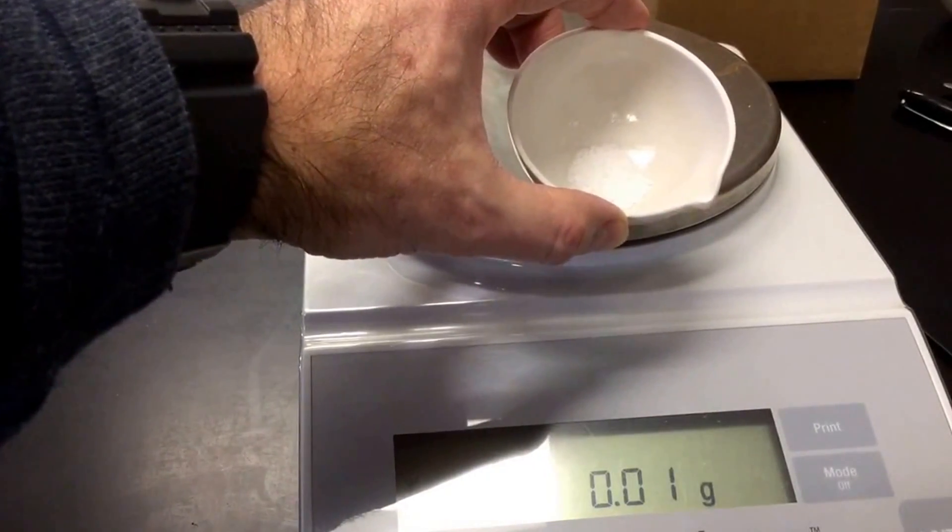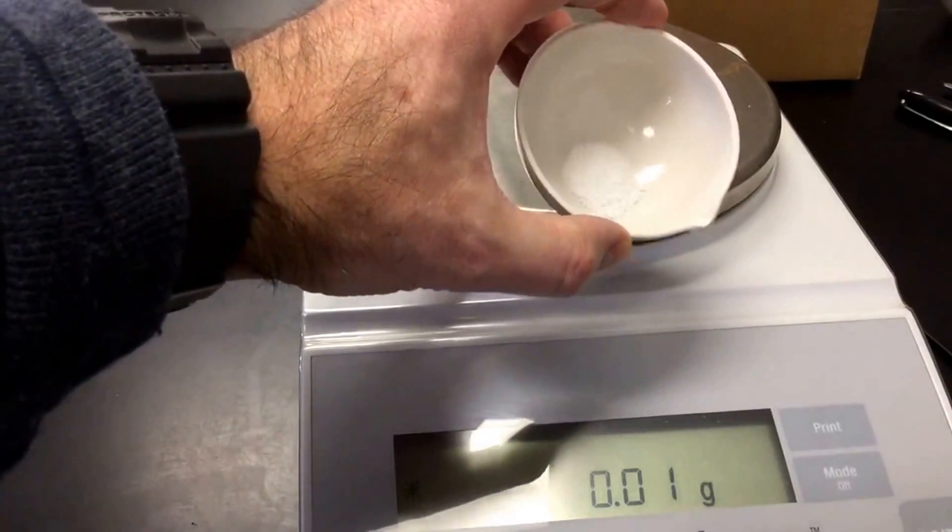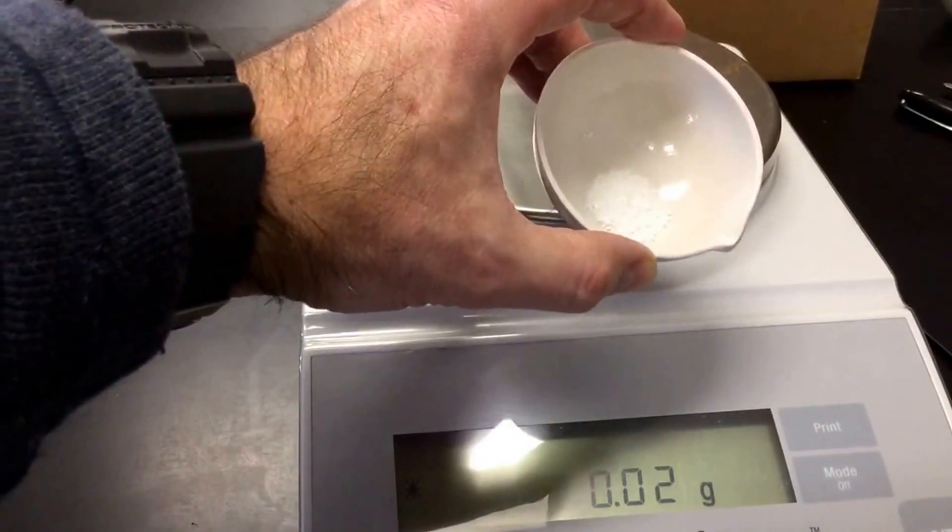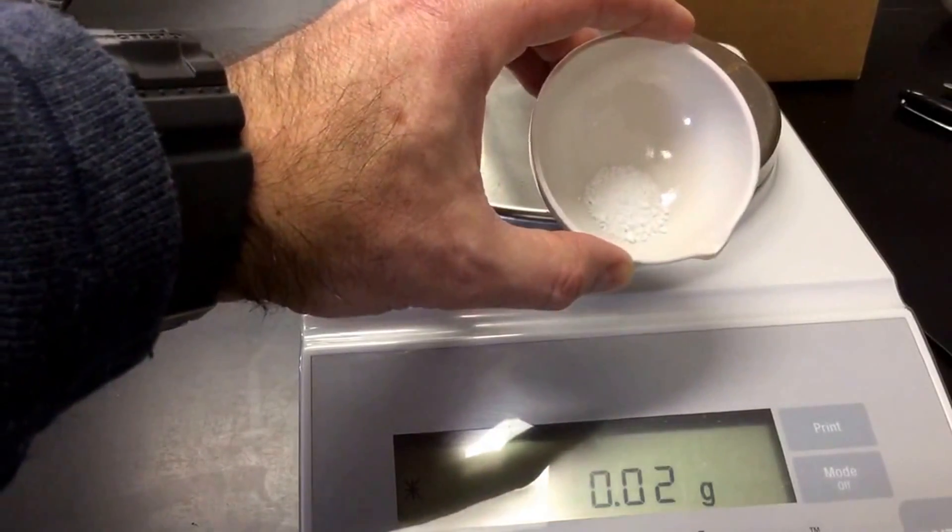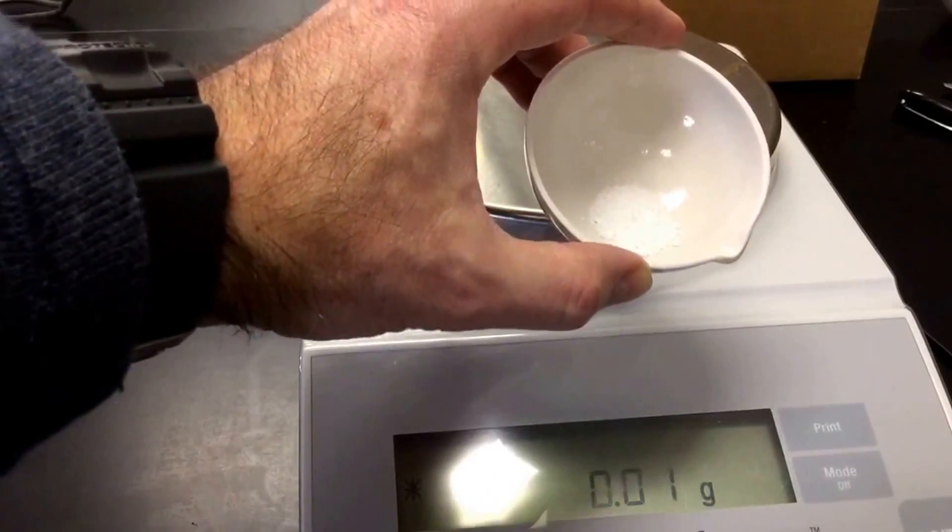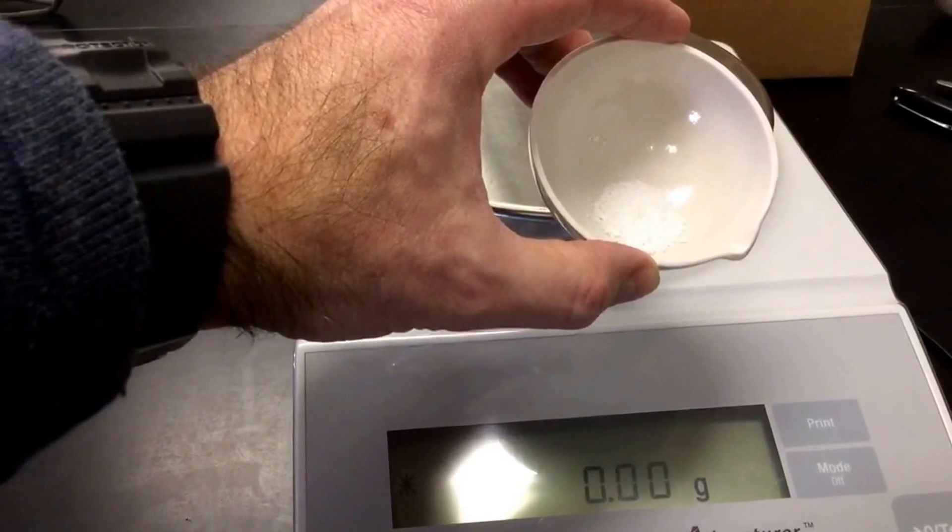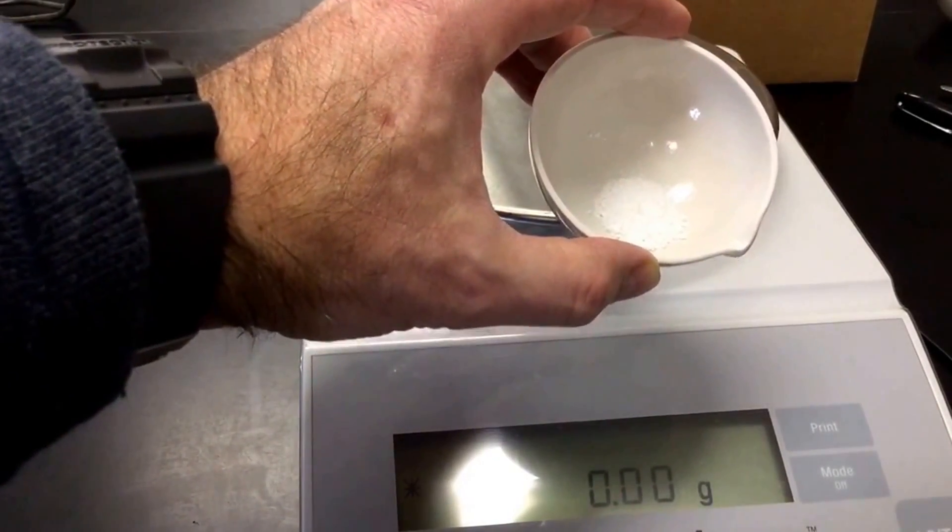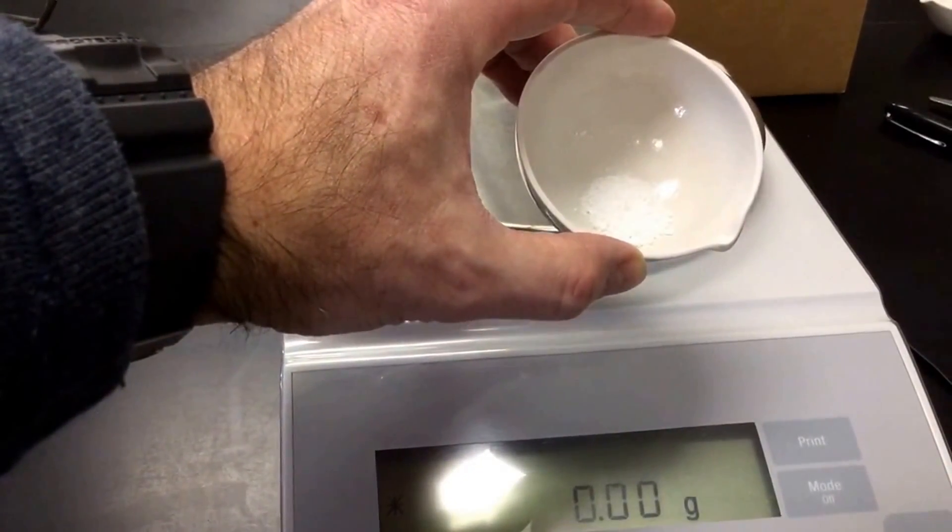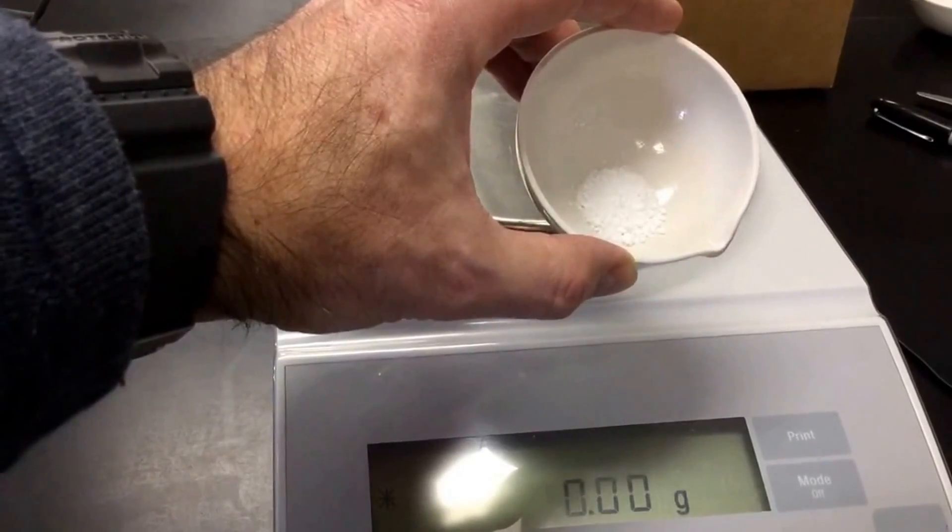Next step we're going to do is we're going to heat this up on a Bunsen burner. And something that you're going to want to take note of is the texture of the magnesium sulfate. And even though it doesn't look like it right now, there's actually water in that solid. So the next thing we're going to do is heat this up on a Bunsen burner and try to burn away all that solid.